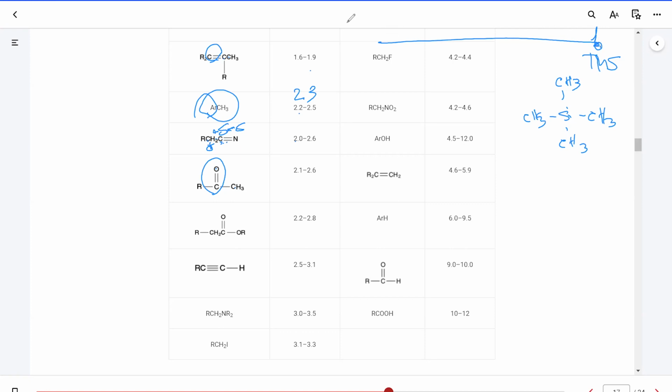When it comes to COOH, which shows a peak between 10 and 12, it is highly de-shielded, so highly electronegative elements, or this group, is pulling electrons strongly from hydrogen, and compared to the TMS is going to be at the extreme high number between 10 and 12.